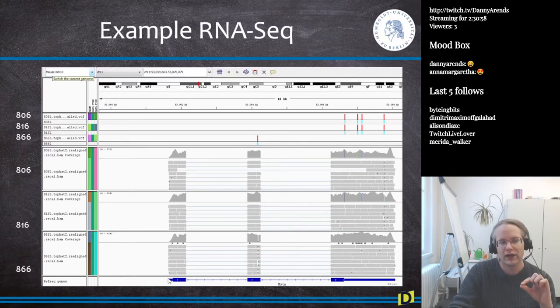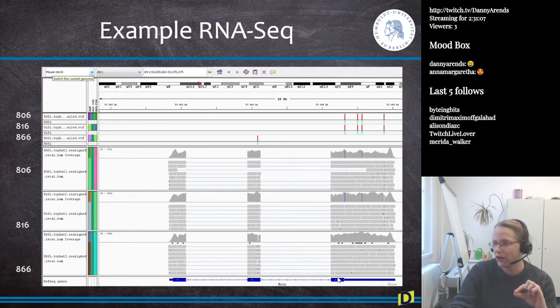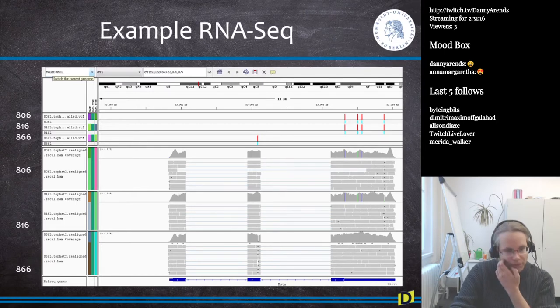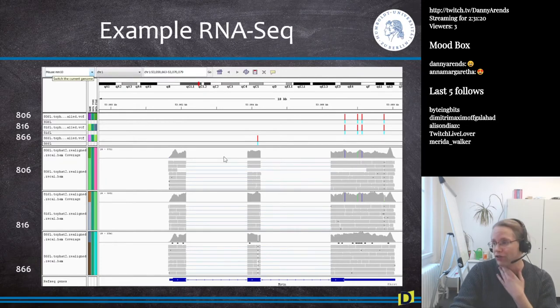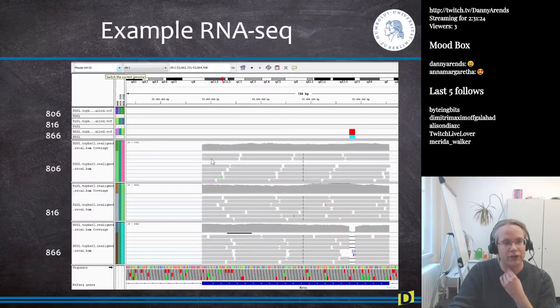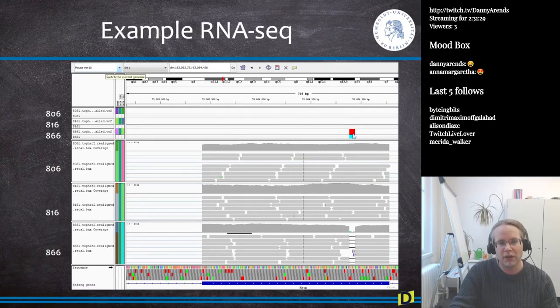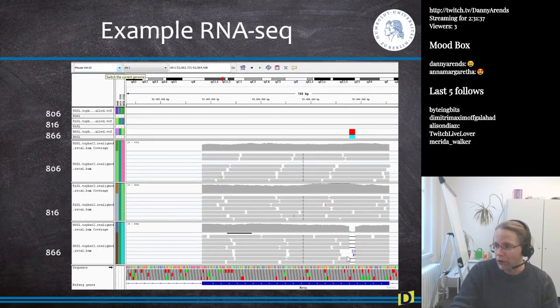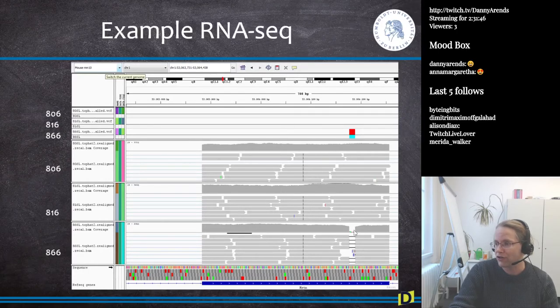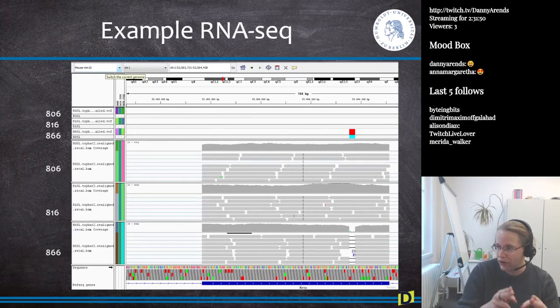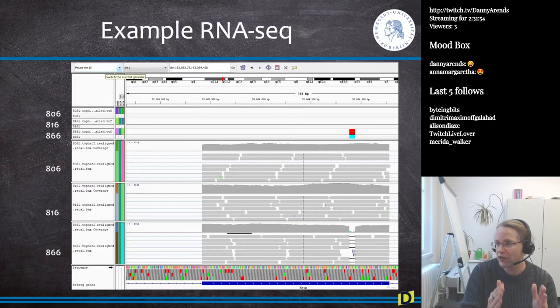Exon one has a small five prime UTR and then the coding sequence; the second exon is purely coding sequence; the third exon has a small part of the coding sequence and then a very long untranslated tail. If we zoom in on exon two of the very muscular 866 mouse, we see a deletion. This means the myostatin protein in 866 is different — a deletion of nine base pairs would make the protein three amino acids shorter.